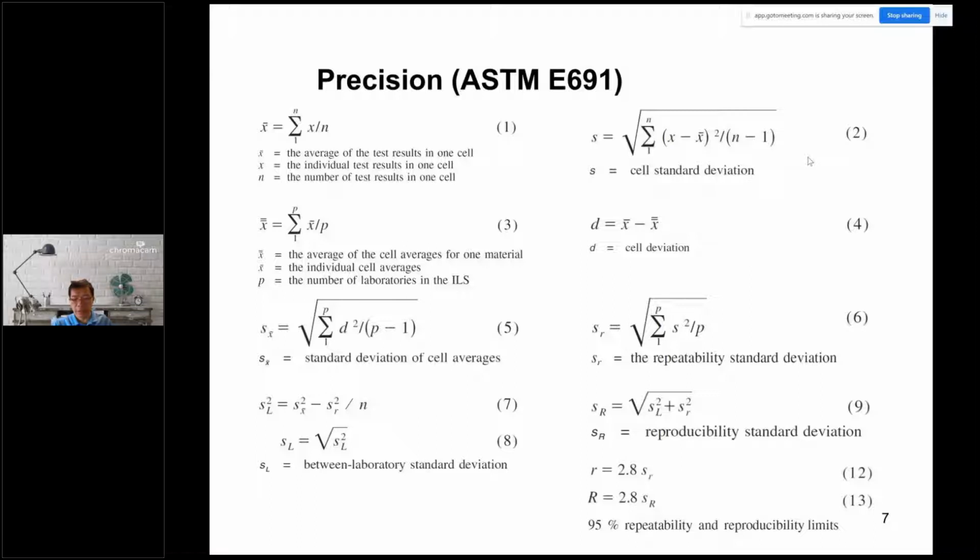So, again, these data points from 8 different labs, each dealing with 10 liquid deicers, and each deicer having 5 replicate measurements, give us a lot of insight about how statistically reproducible and repeatable the test is. Again, repeatability deals with a single lab, and reproducibility is really about across labs.